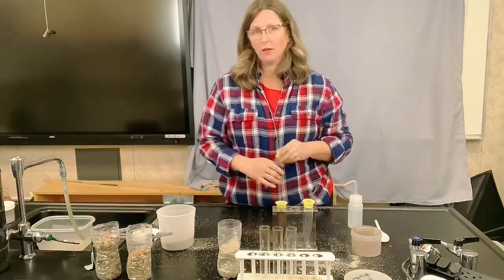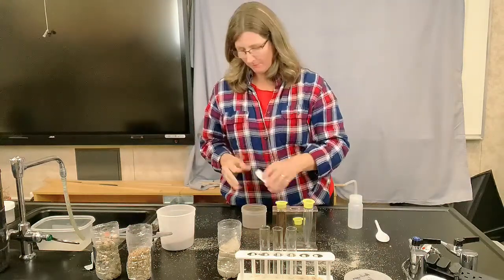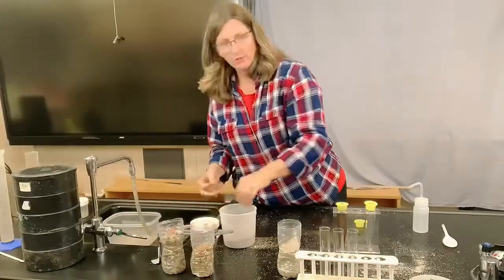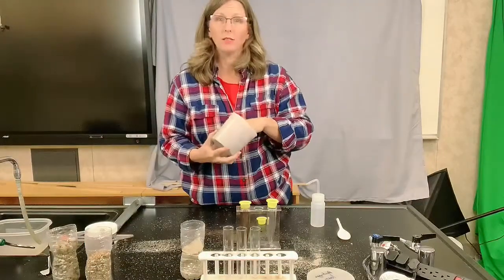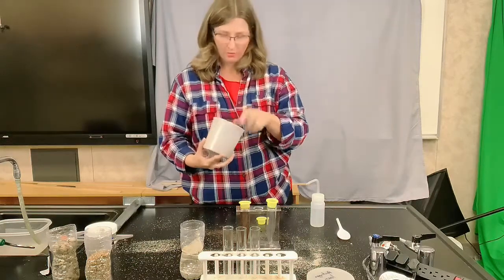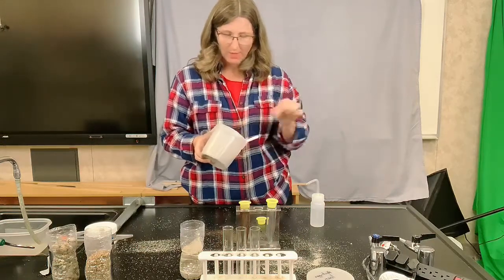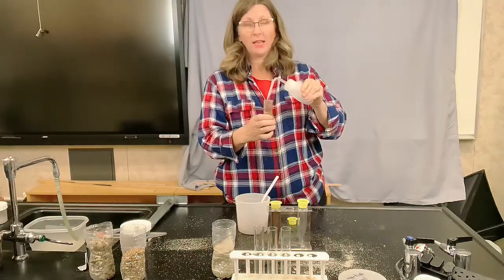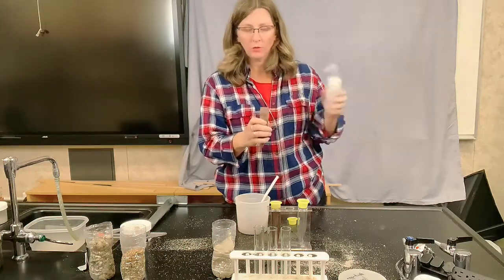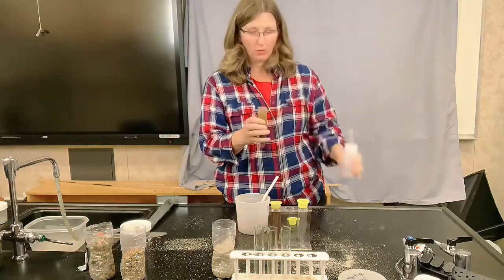I'm going to do a couple different ones so that you can see the different color. This is the soil from Santa Margarita Ecological Reserve. This is a soil that my student Justin brought us, and I think he said this was Central Valley. So he brought this from agricultural trip to Central Valley. So we'll just compare those two soils, and then I'll show you a basic sand. With your sand, silt, and clay, that changes how the water is going to move through the soil, and that changes how your nutrients will be able to stay in the soil or leave.